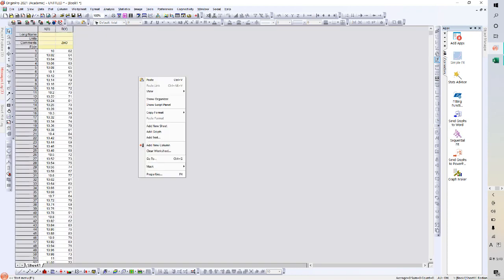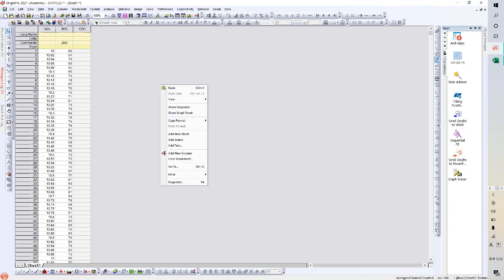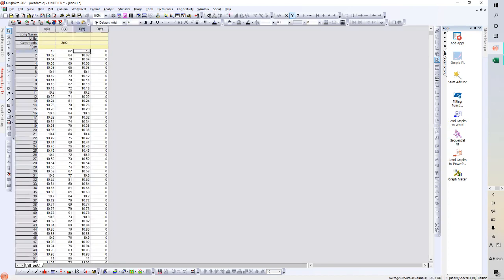Before you initiate the Control V, when you right click the blank space of the Origin, add new column, this thing appears. So repeat that twice. And yep, this will appear. And I'll write zinc oxide simulated.